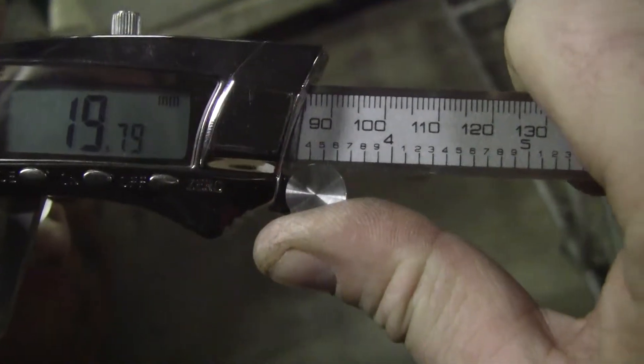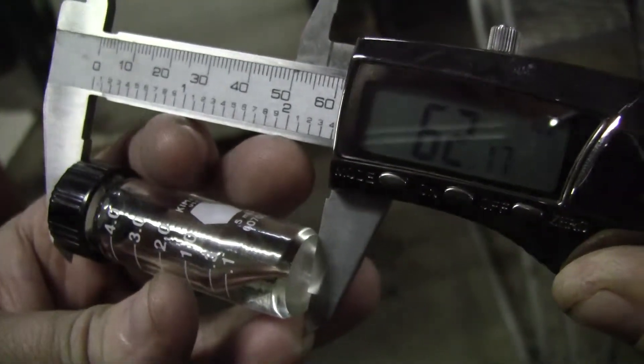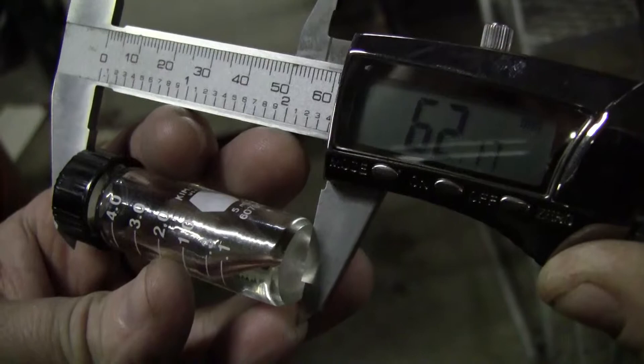We have a width of 19 millimeters and a height of 62 millimeters. So the width might need to be a little bit narrower, but it does fit, and the height is perfect for it.